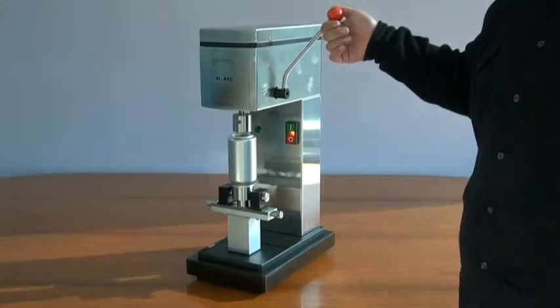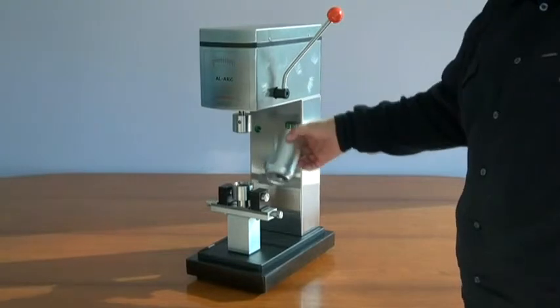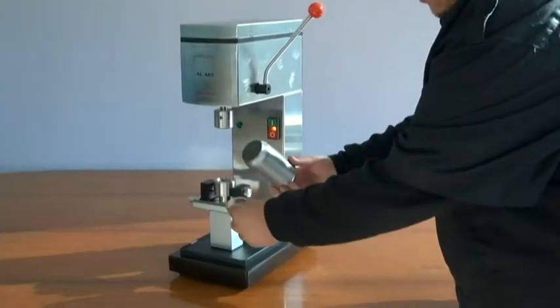The Advanced Lab Seam Stripper removes the seam cleanly from the can, maintaining its integrity for further optical or mechanical profile analysis.